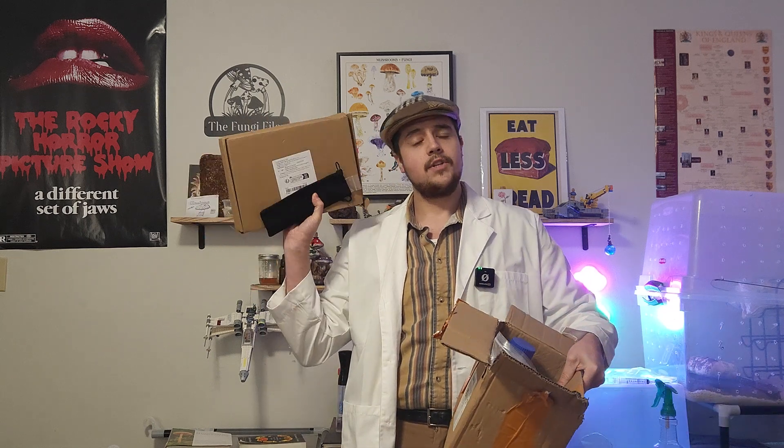Today we're going to be taking a look at some Temu mycology finds for you, or maybe some good holiday mycology gifts for some friends or family. I happened to need to order some stuff from Temu for another project and while I was there I found a bunch of mycology items and figured it would be cool to test some of them out and review them after a little bit of using them.